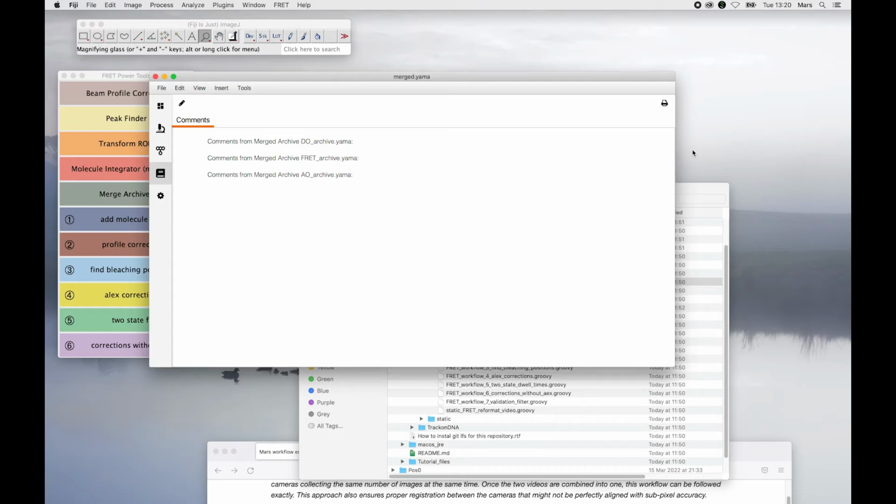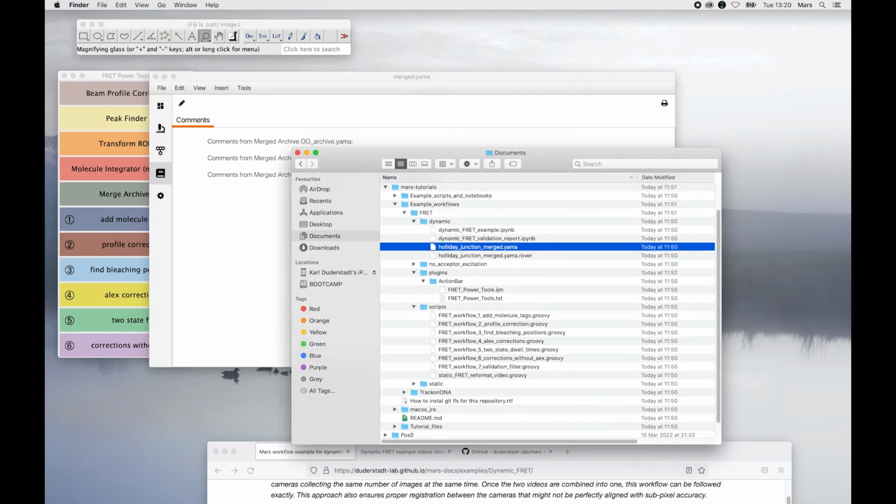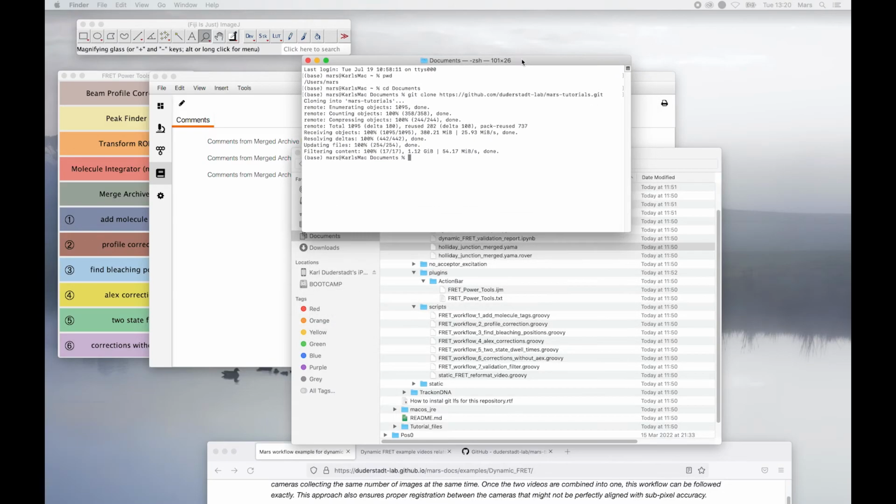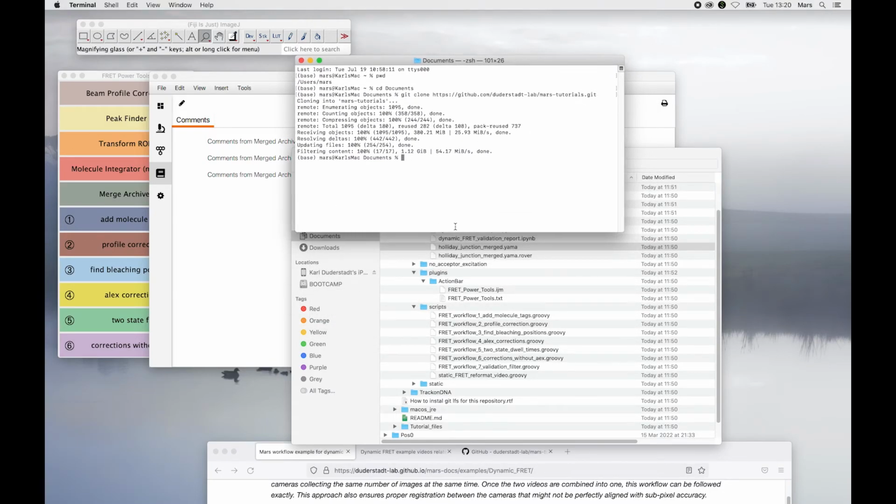So we've provided some Jupyter notebooks that actually illustrate that. So I'm just going to go ahead and open those up. So I've installed Conda, Miniconda, onto this account, and I've installed PyImageJ following the tutorial directions on the docs website.